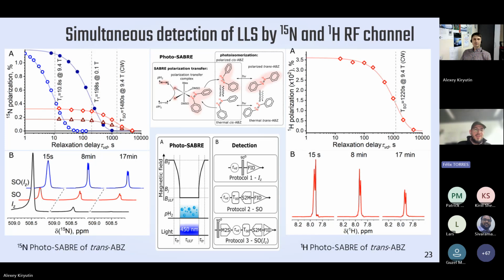Maybe I have a follow-up question for you, because one thing that I remember from 2D hyperpolarization is that often we can use gradients, for instance, to measure 2D within one scan. One challenge is often to recycle the hyperpolarization from scan to scan, so we tend to either do that or use small angle excitation, so that we can keep some polarization along the Z axis.